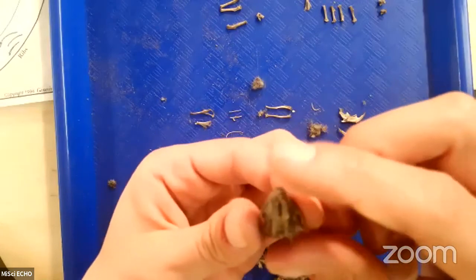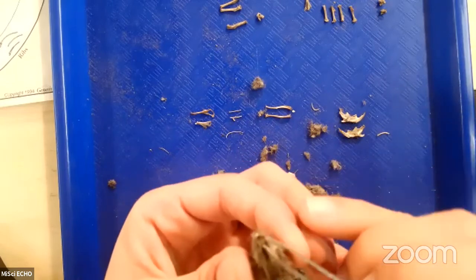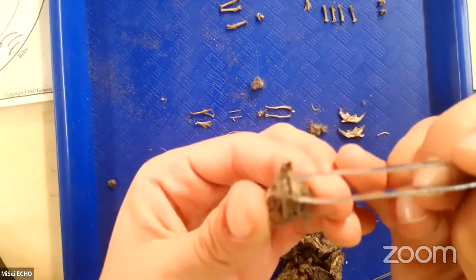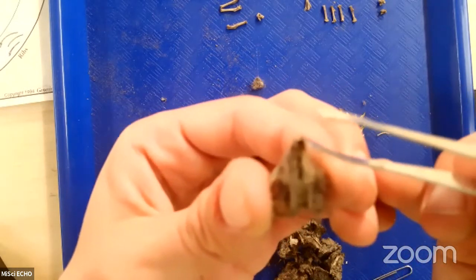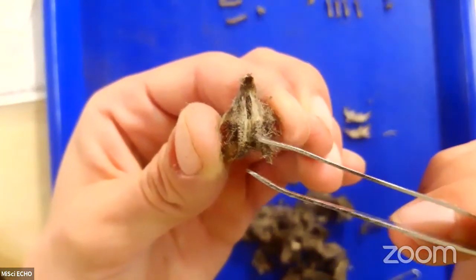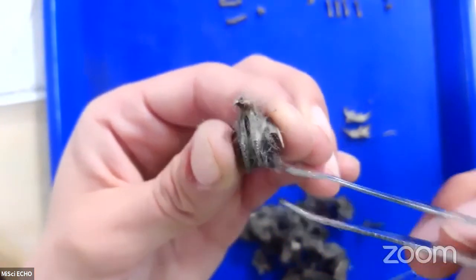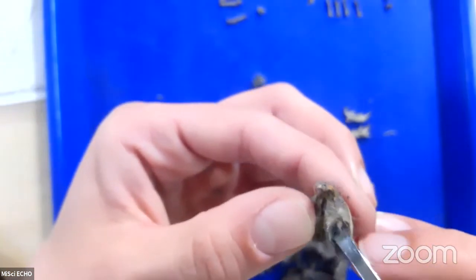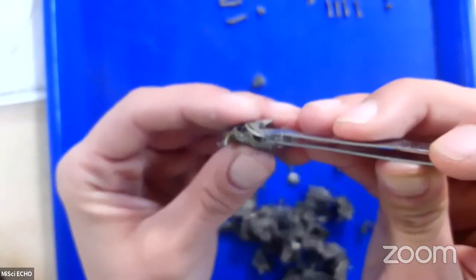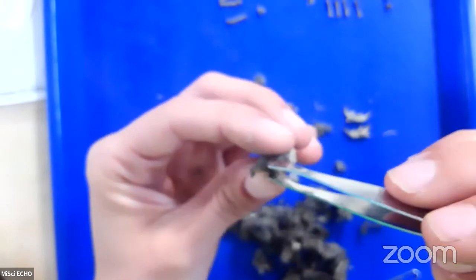Like we're just starting to expose some of this top side of this skull. So this would be like looking at the roof of this organism's mouth. So you can see the top part of its jaw. We've got the front incisors, those pointy teeth there, but we've also got these molars or other teeth from this rodent as well. So we'll confirm that it's a rodent by comparing to our sheet once I get just a little bit more of our fur out of some of the different orbital sockets, which are where the eyes of this organism would have been in life.